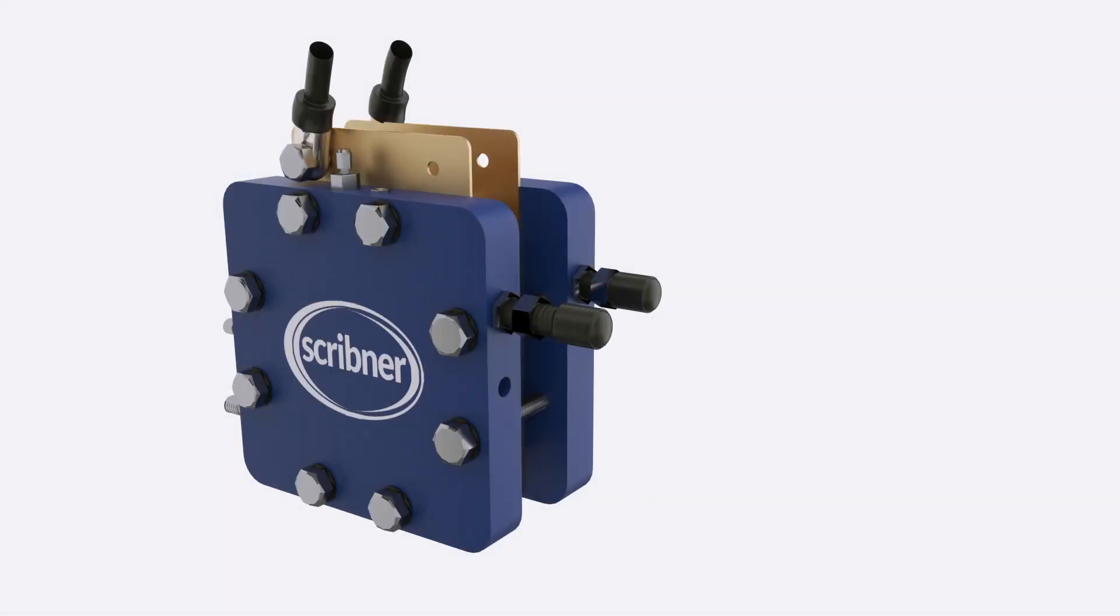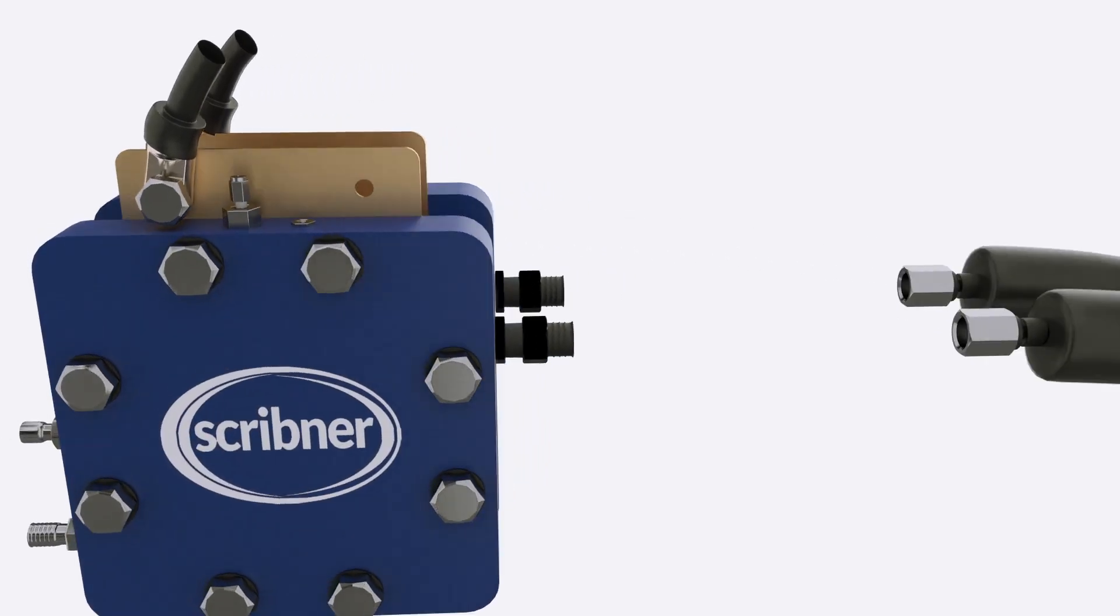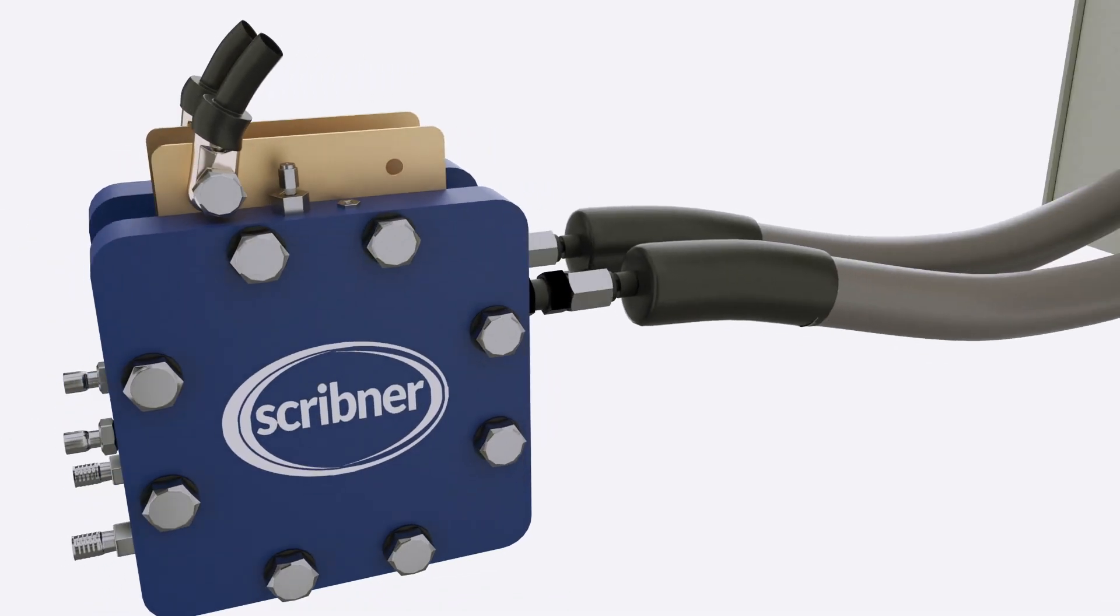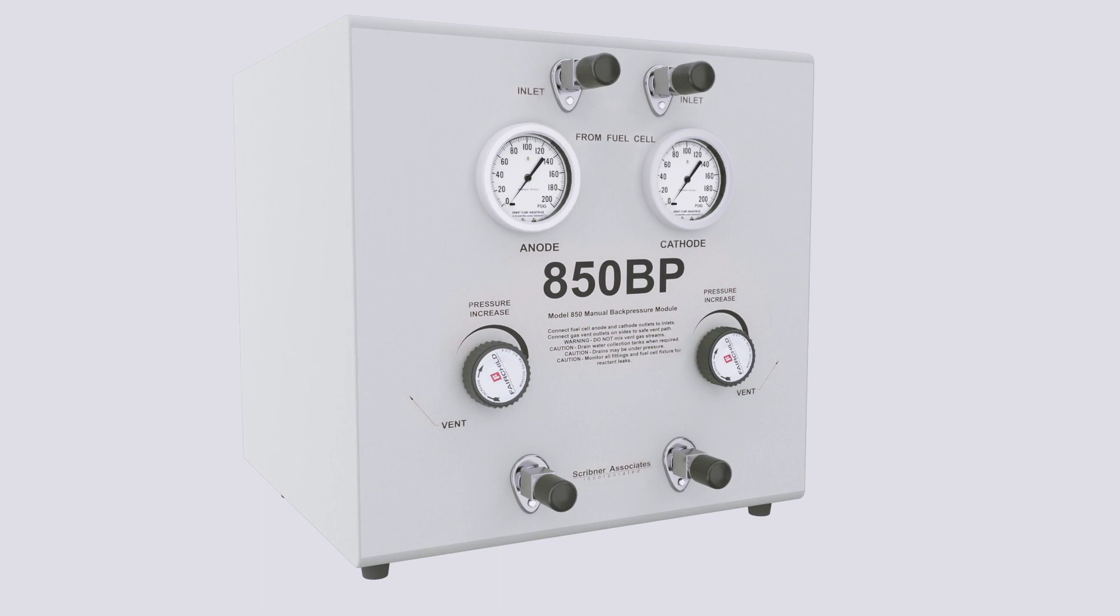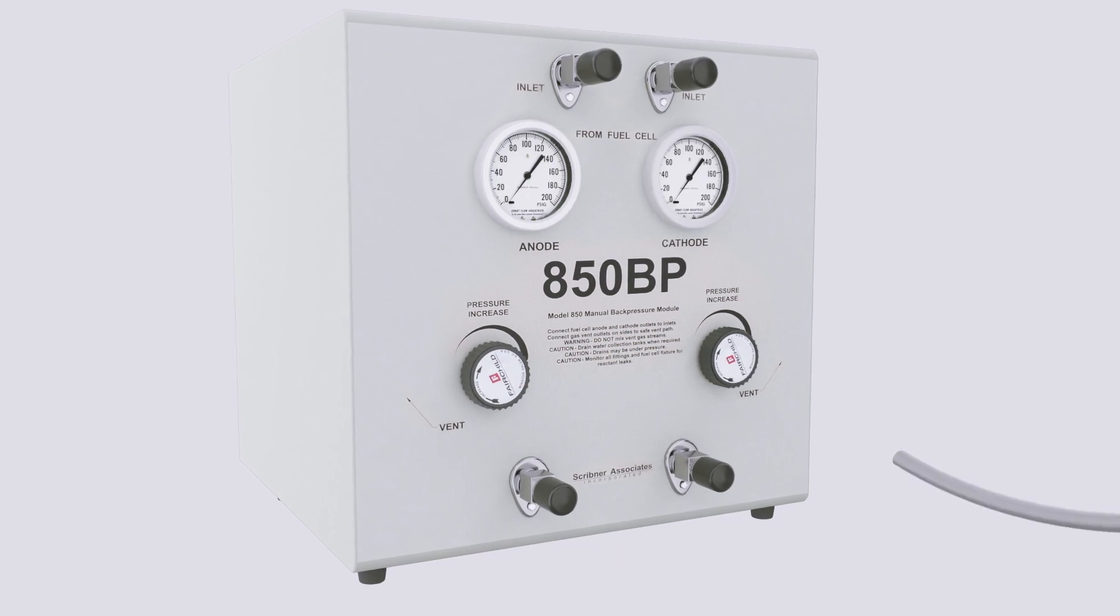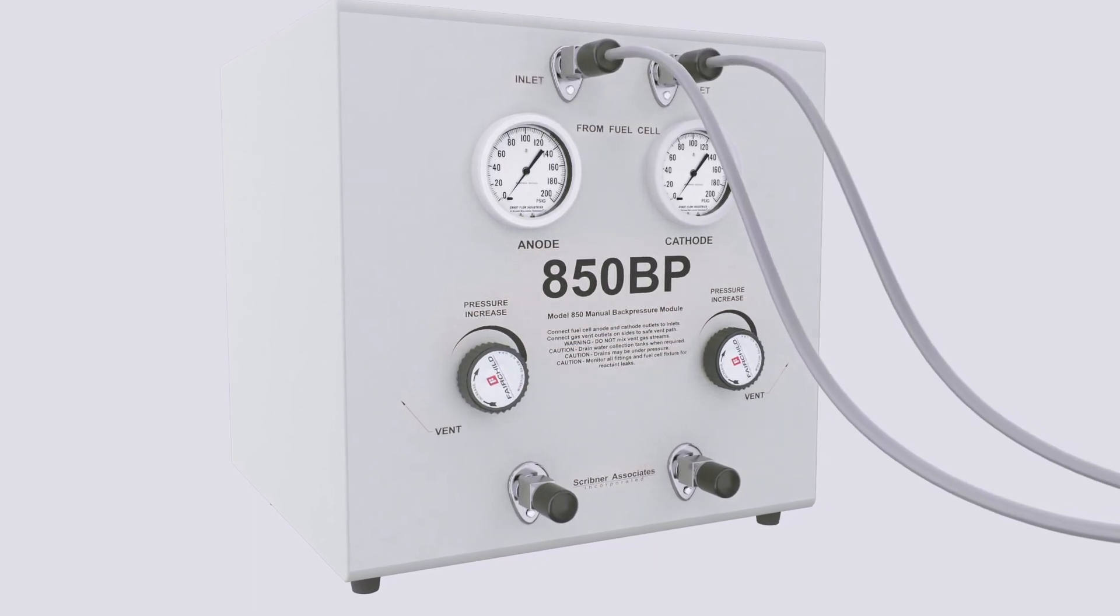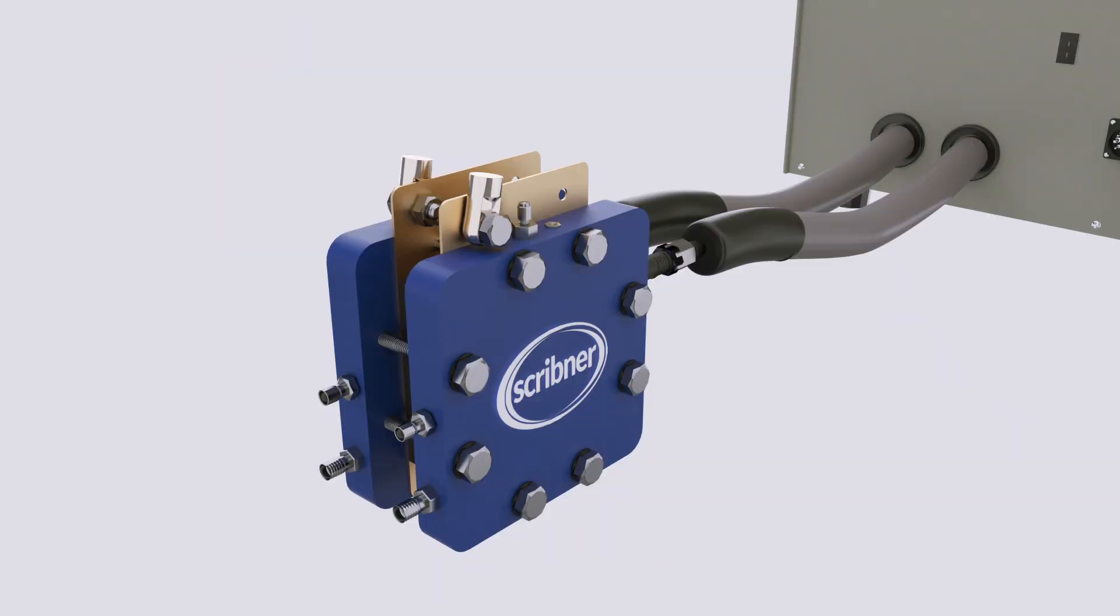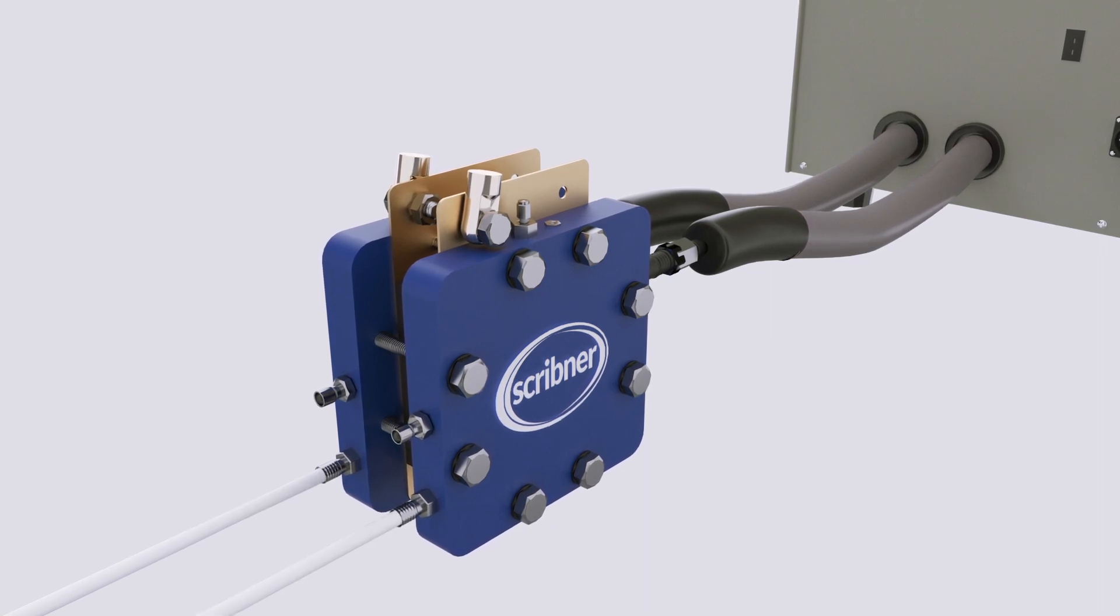Remove the protective caps from the 850 heated lines and connect to the cell fixture's inlet ports. Connect the cell vent tubing to exhaust or back pressure system inlet ports. Connect cell exhaust to appropriate vent, such as fume hood.